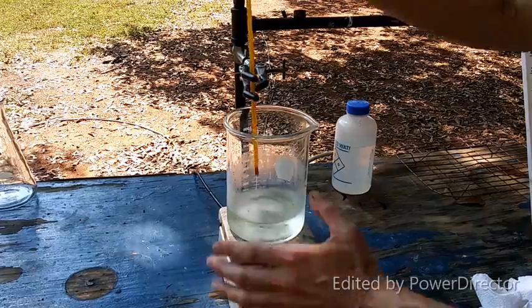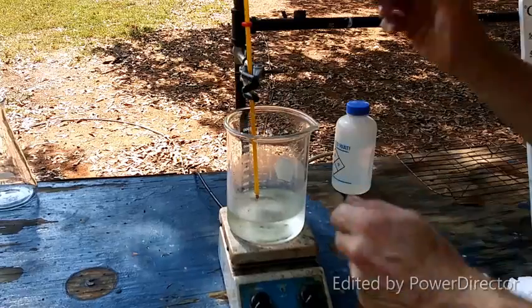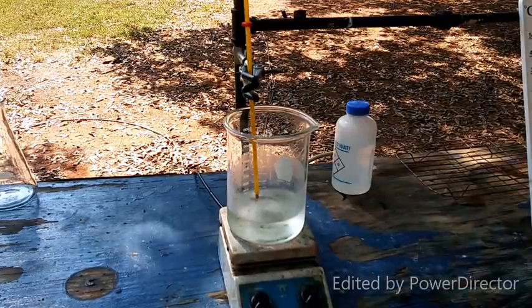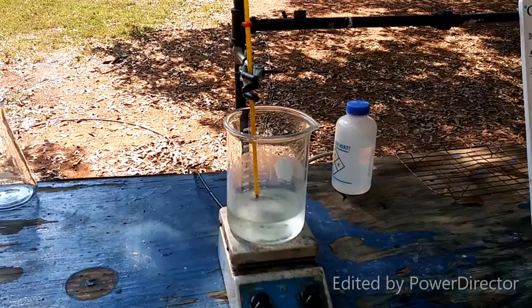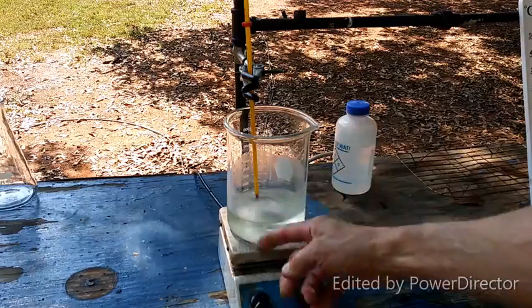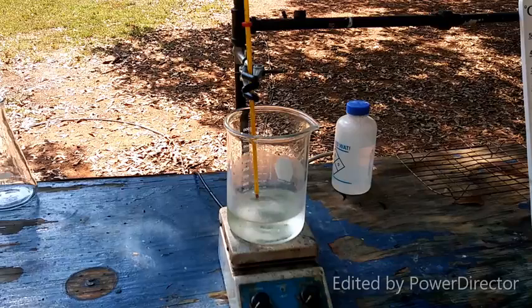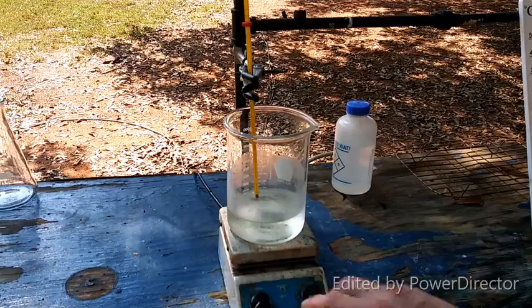So, it's time to add the hypochlorite solution. Now, what we're going to do is add hypochlorite to this, and allow this to stir for 15 minutes. As the reaction happens, the temperature should go up to somewhere between 35 and 40 C. Theoretically, the temperature out here is already almost 30 C, so we'll see how this goes.